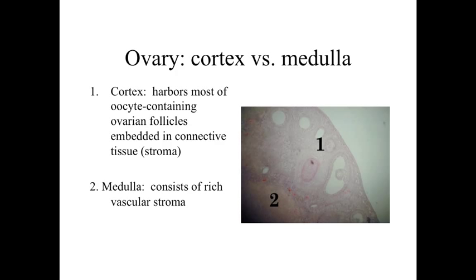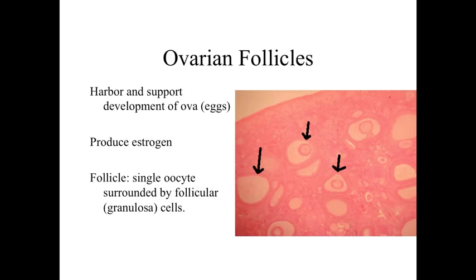If you take a look at the low magnification view of the ovary, what you can see is an outer cortex region where we're going to find the oocyte-containing ovarian follicles. You have a lot of circular profiles with the oocyte in them, surrounded by the ovarian follicular cells. Deeper to that, we're going to have a medulla, which is a relatively small structure without the ovarian follicles, and a very rich vascular stroma supporting meshwork.